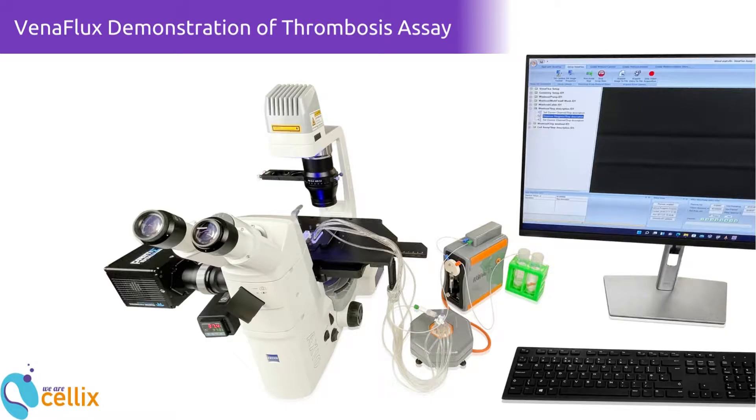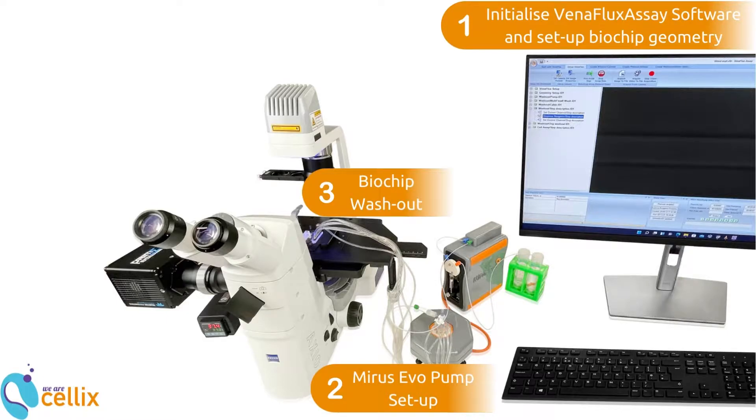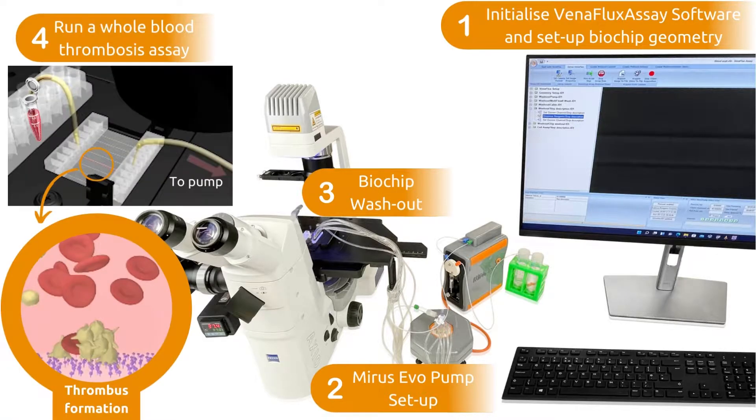The video is divided into four main chapters: 1. Initialize Venaflux assay software and set up your biochip geometry. 2. MyReceivo pump setup. 3. Biochip washout. 4. Running a whole blood thrombosis assay.